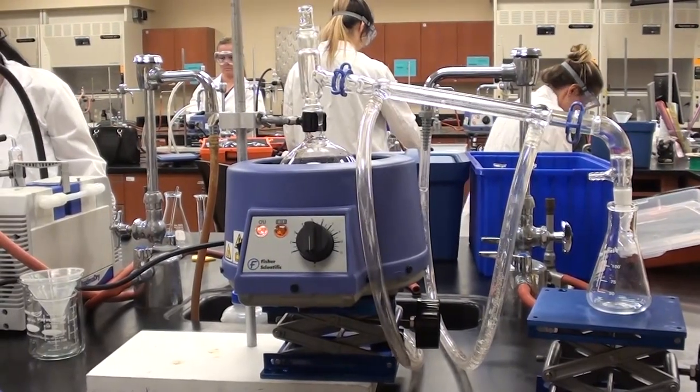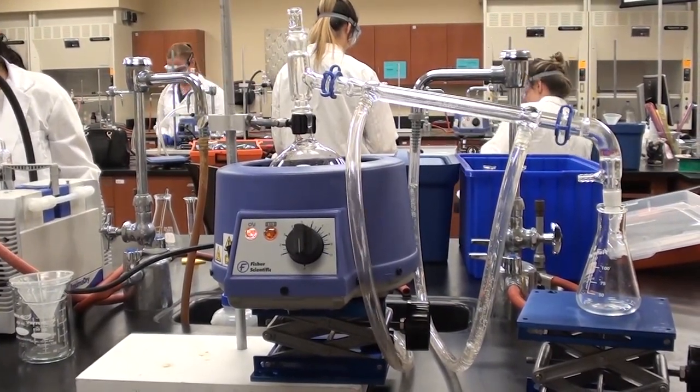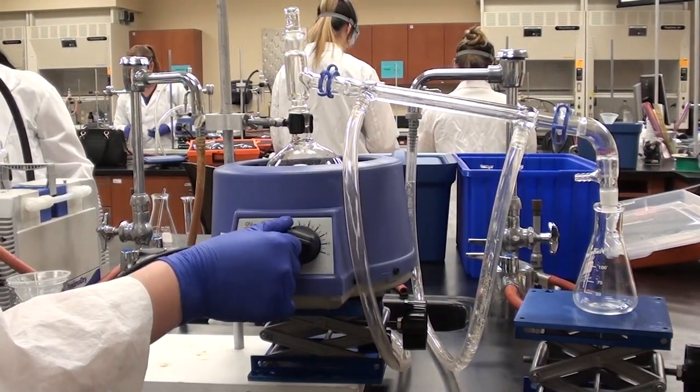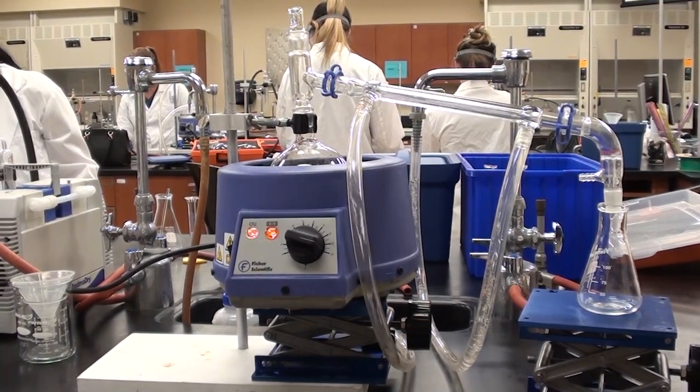Now we can get started on the boiling. For this, what I recommend is starting on 10 to boil it. Then once it starts to boil, we will lower the mantle. We'll come back to this once it starts boiling.